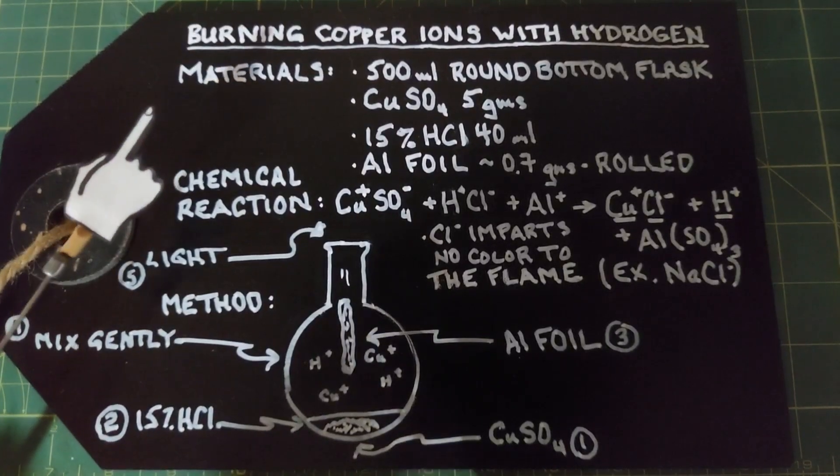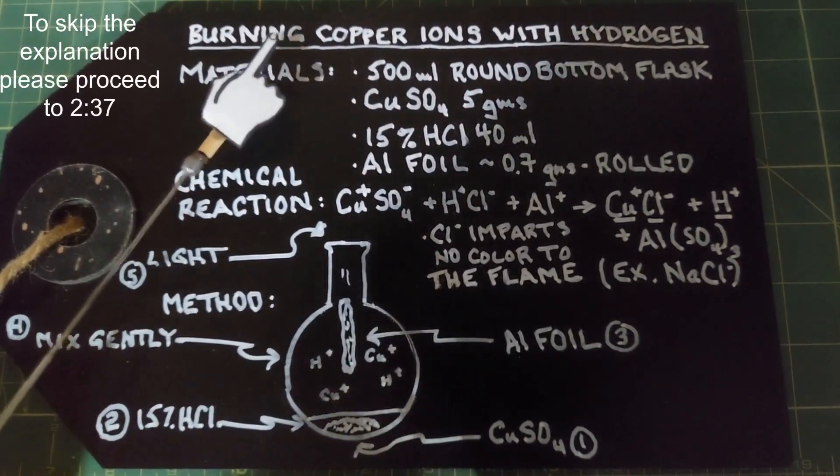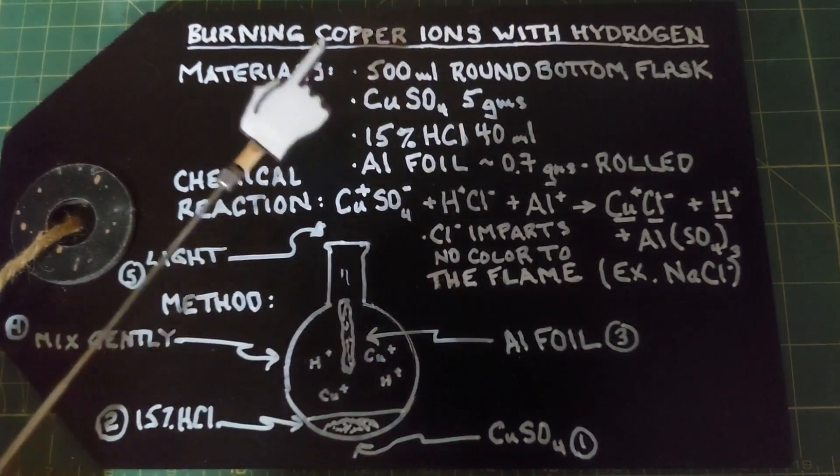We are going to look at a pretty unique reaction that's rather beautiful in this video — it's basically burning copper ions with hydrogen. I ran across this on a Russian chemistry channel and thankfully it had some subtitles so I could make out a little bit about what was going on.